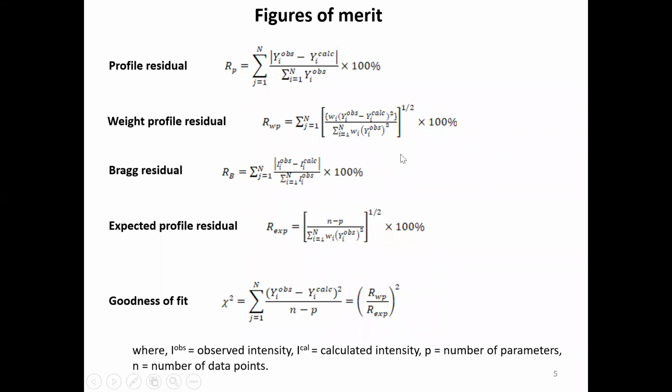So what I am asking is, if RWP and R expected values are the same, not 0, but the same, then also the fit is good, right? Or is the ratio always needed to become 0?